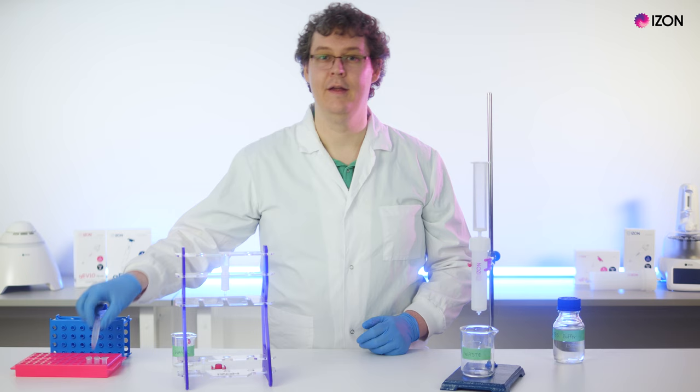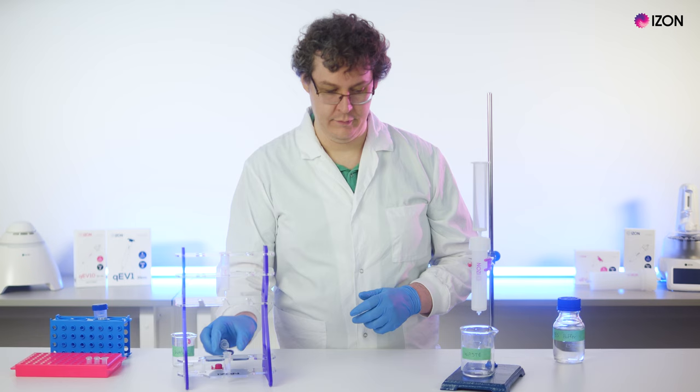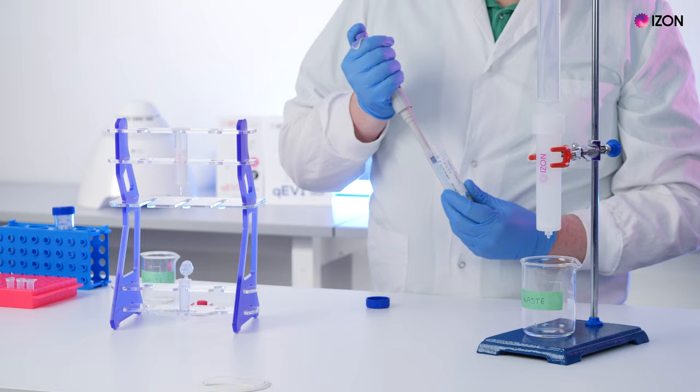Once your column has been flushed, put your collection vessel in place under the column. This will be either your labeled buffer volume collection vessel, or if you do not wish to collect the buffer volume, then this will be your waste vessel. Then you can load your sample.